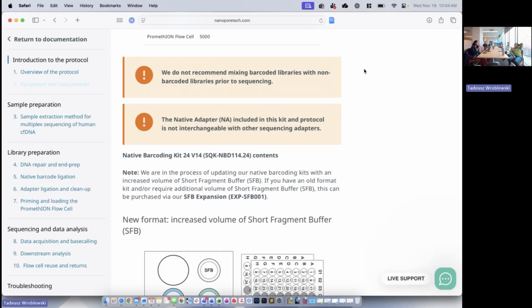If the number of pores is low, it will show that. Then please do it one more time and make sure that is the case. If it happens, email me or email Sam. We would be able to replace it if it is below our warranty, but it has to be within that time period, which is 12 weeks.